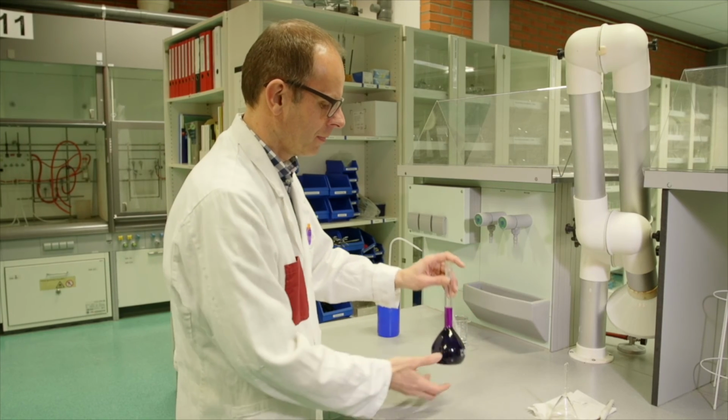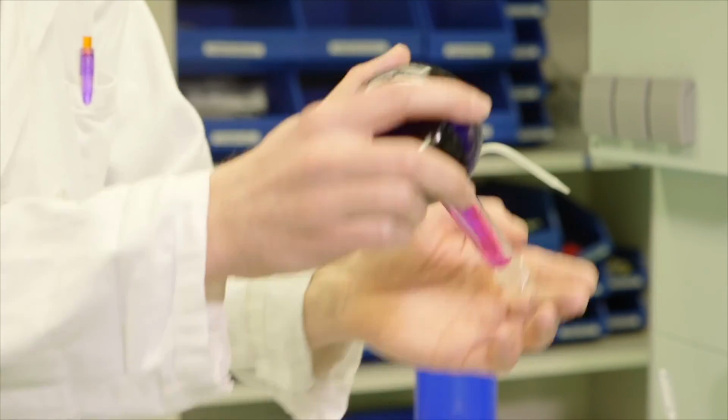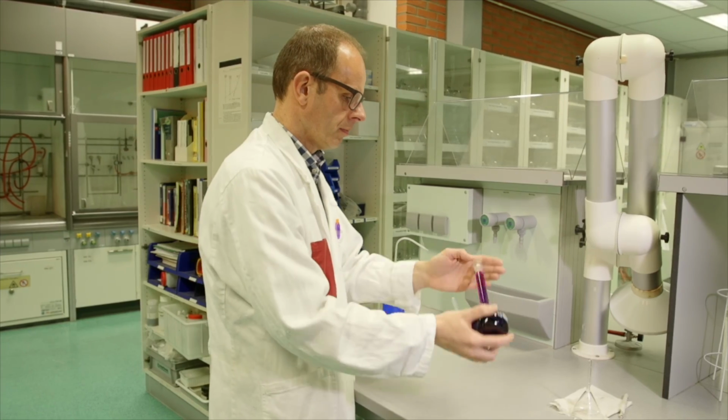Finally, the solution is homogenized by inverting the flask 10 times. The solution is now ready for use. Sometimes there are air bubbles in the solution after homogenization. This is not a problem if the solution is homogeneous.